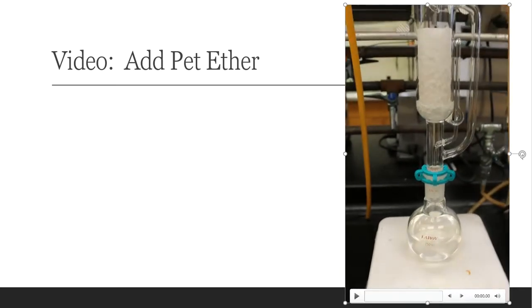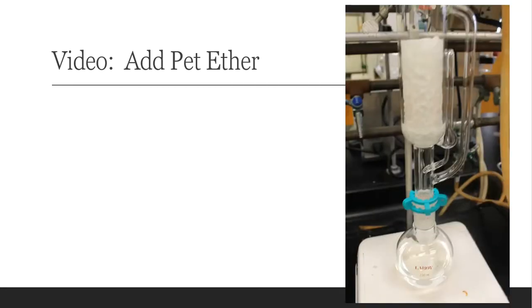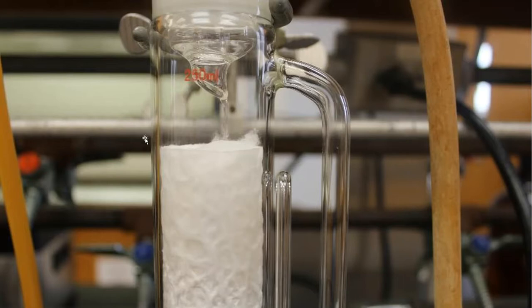Okay, so that was the really difficult task of filling up a Soxhlet extractor. Ha ha, give me a break, right? They tell me to do this in a job, and this is all that I have to do when I get paid? Well, yeah, that's kind of what goes on, especially in environmental work, which is where you see this most often.